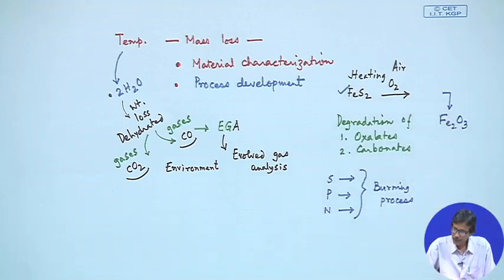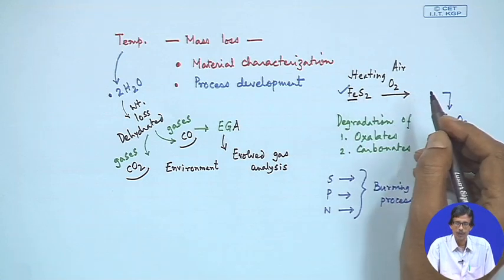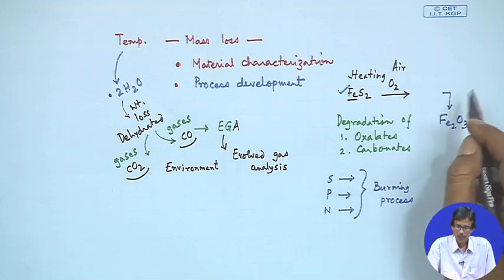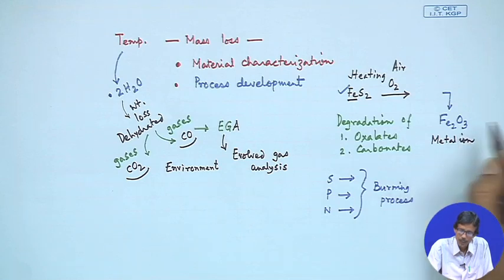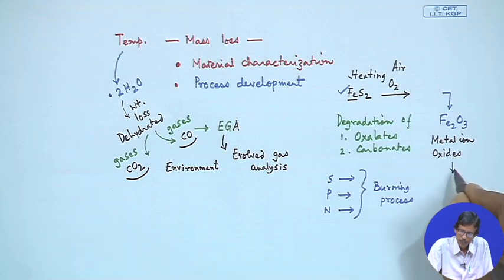So, quantitatively we can determine the amount of iron which was present in this unknown sample. Any other sample containing these metal ion species can be converted to its corresponding metal oxides. And sometimes we are able to prepare these metal oxides, because originally these are present in some oxidation state of +2 or +3. So, from metal oxides, we can produce fine particles.